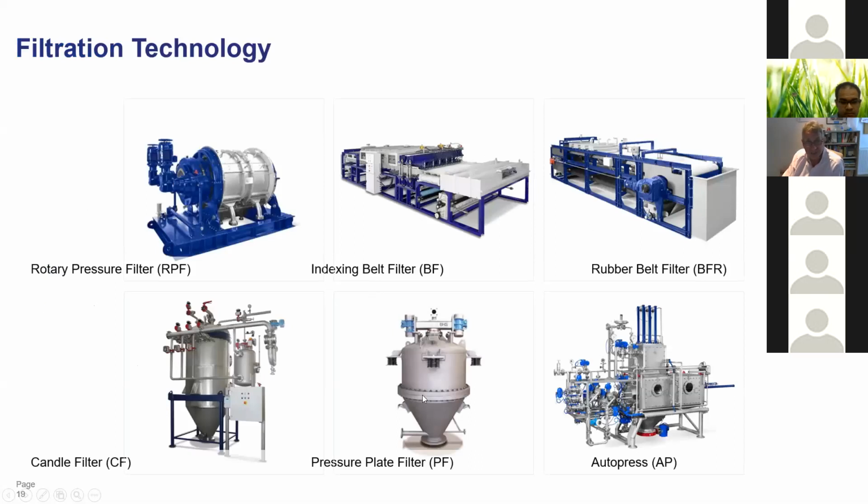So here's some of the filtration technology that's available today, and I always regard filtration as the equivalent of printing when you're operating a computer. You can operate a computer, you can operate your iPad, but if you want to print something off, then that's a completely different world. Oh no, my printer's broken, and it's completely separate from your computer. And it's the same with filtration. Filtration is a completely different world to catalytic hydrogenation.